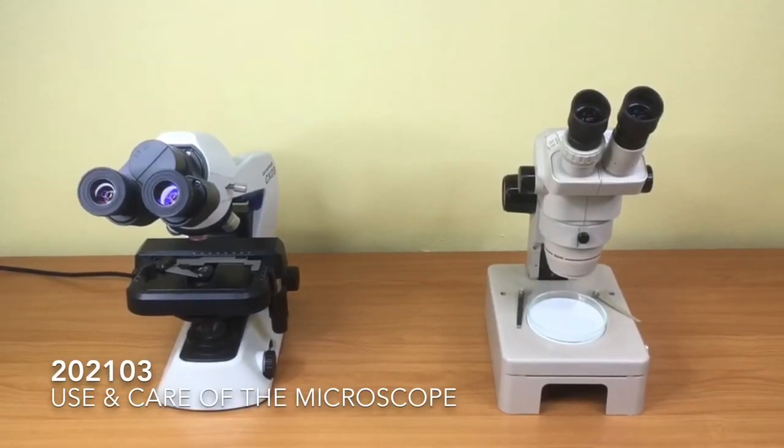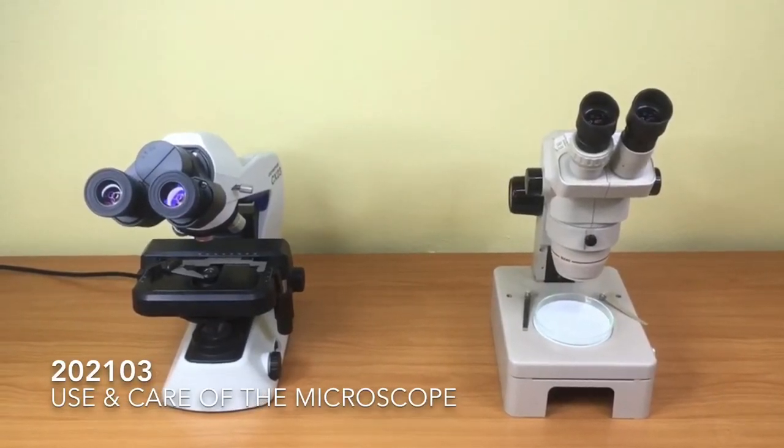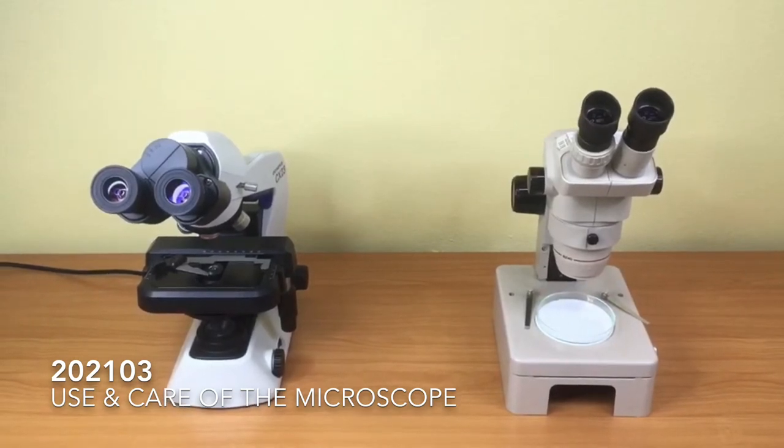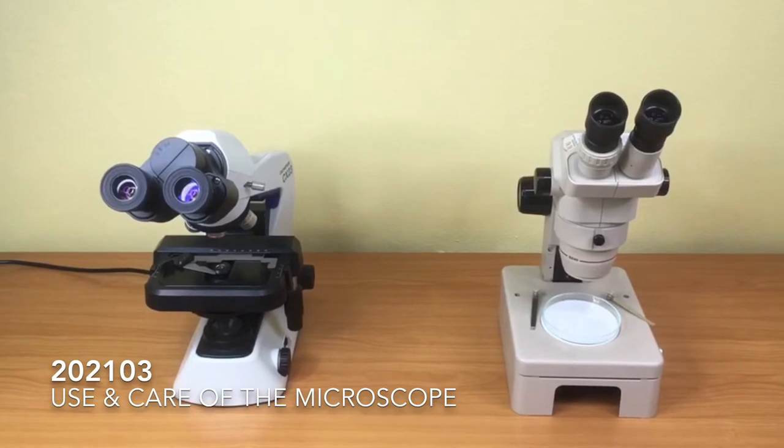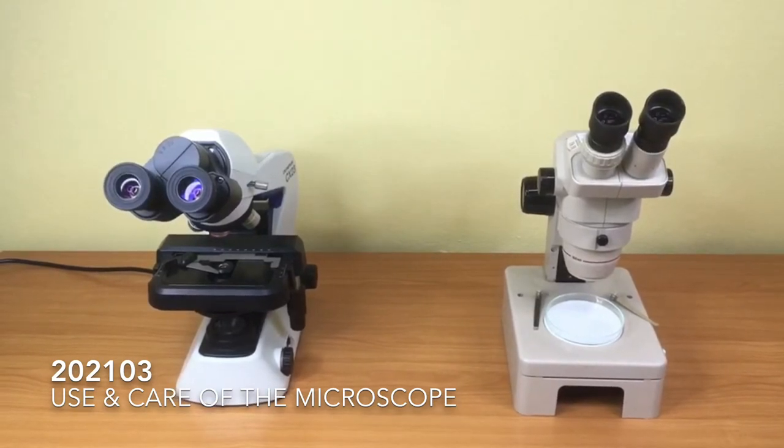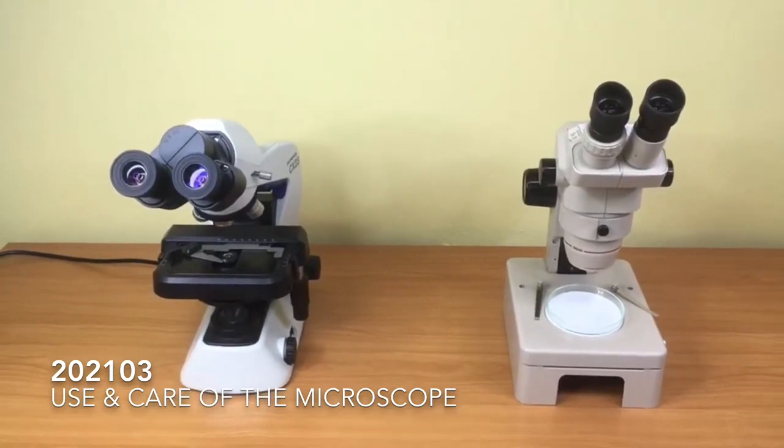Welcome to the first online lab. We will learn how to use microscopes and how to do scientific drawing. Let's start with basic information of microscopes.